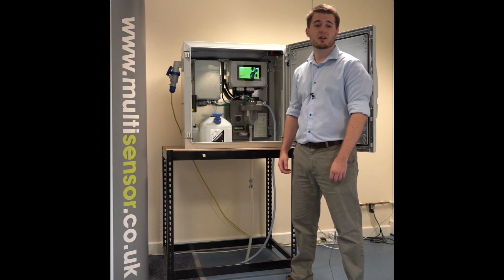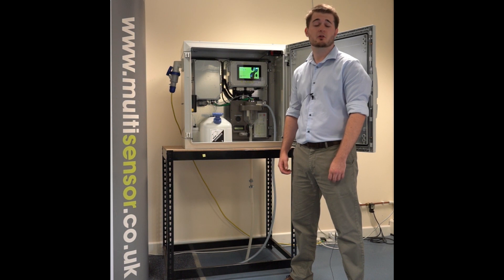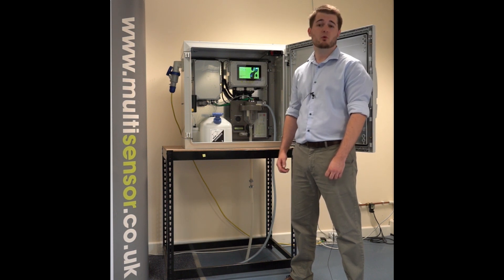The MS-3500 is the first ammonium monitor in the world to be specifically designed to work at the raw intake of a wastewater treatment plant. By measuring ammonia at the intake, the MS-3500 provides an operator with important information that allows them to control and optimise their ammonia removal processes.